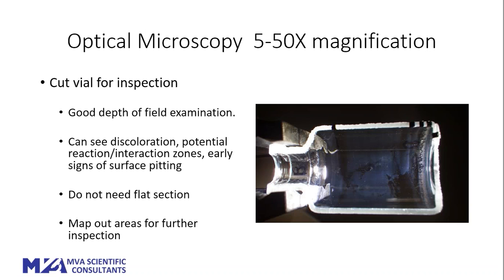We cut the vials in half, labeling the two halves A and B. You can see that on the top edge of the half vial there are small strips of adhesive used as markers in the SEM to maintain reference points. Starting with optical microscopy, you can see some dark areas and splotchy regions toward the base of the vial at the heel area. Those would be the areas we'd take a closer look at with higher magnification.